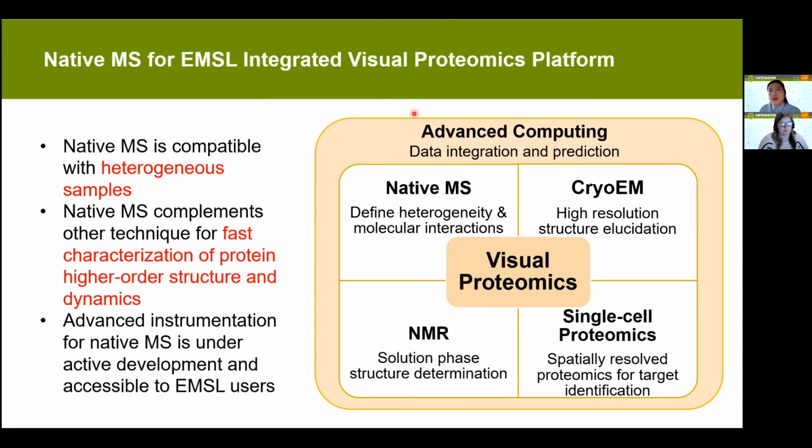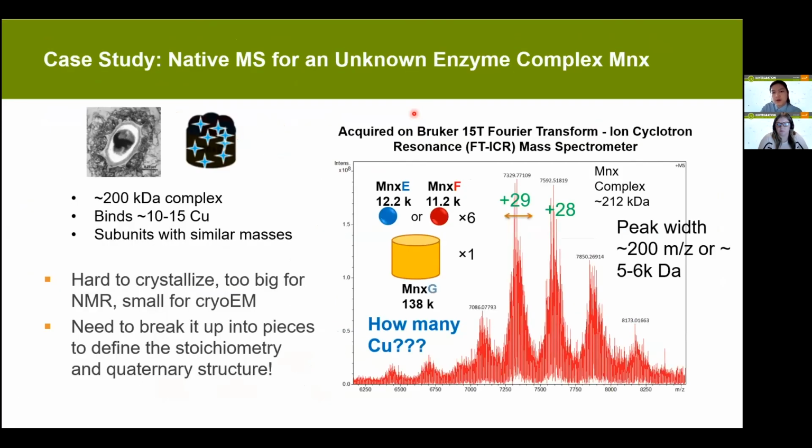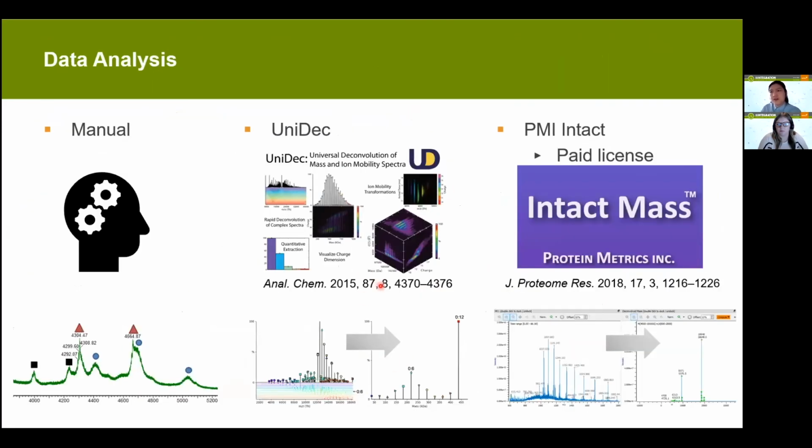There's a commercial software, and then the other one is not in-house. It's developed by another faculty member. We haven't done a very sophisticated comparison. I would say there are different advantages and disadvantages. So the UniDec one is very flexible, and it's designed for native mass spectrometry experiments because the developer, Michael Marty, is a native mass spec person. So there are some very specialized functions you can use, for example, for membrane protein or nanodisc as special tools for that.